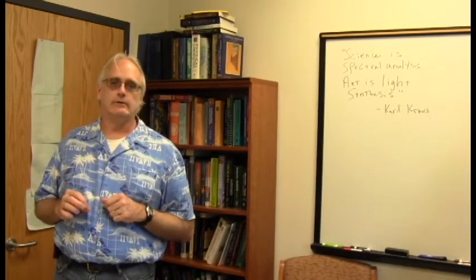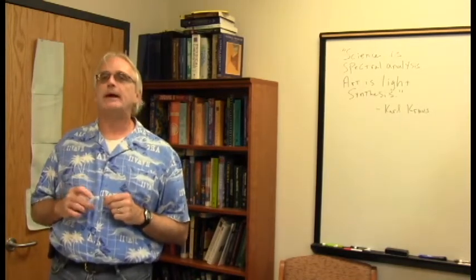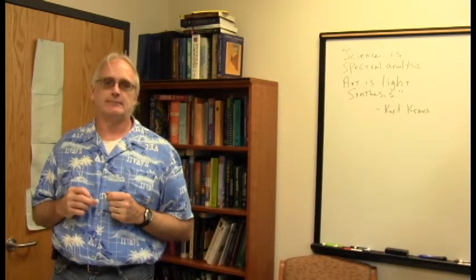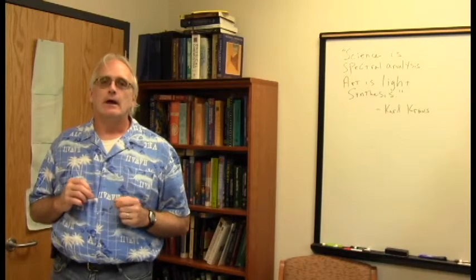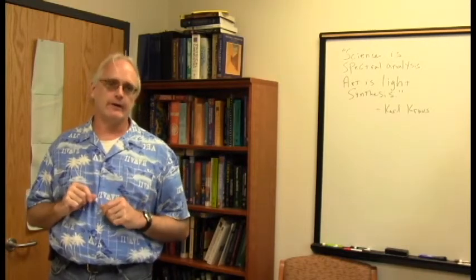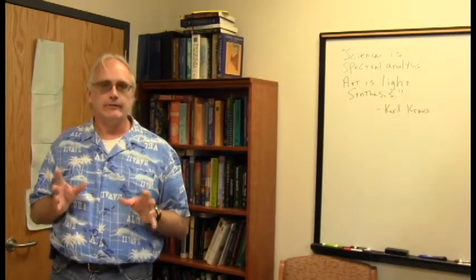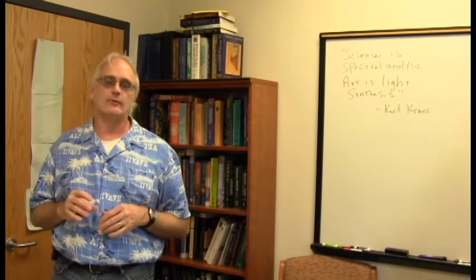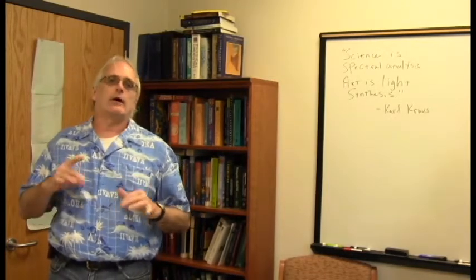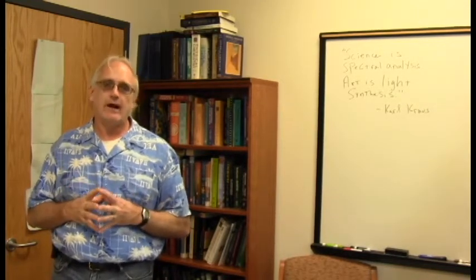Now I want to show you a proton decoupled spectrum of pentene. Now remember when we did heteronuclear decoupling for carbon-13, I told you what we do is we essentially shine in all the possible radio frequencies for proton. In other words, that collection of around 4,800 hertz centered at right around 400 million hertz, 400 megahertz, and make every one of the protons oscillate so rapidly between their spin states we just see the average effect.